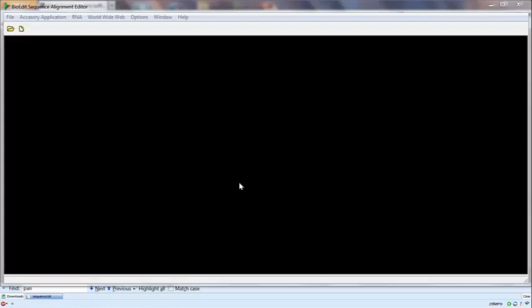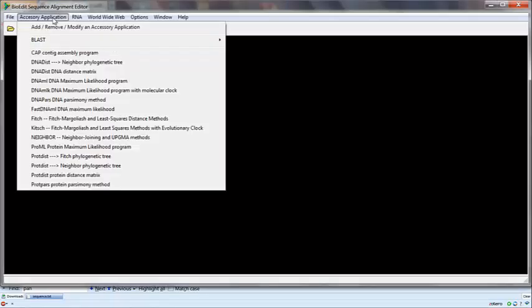One of the reasons I like BioEdit sequence editor is because you can add third-party software or programs, which can especially run from the command line. So even if it is a GUI, you can add them into the accessory applications menu and use them directly with sequences that are open in BioEdit.